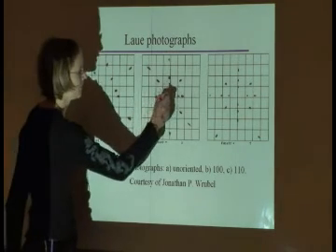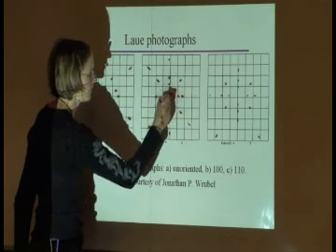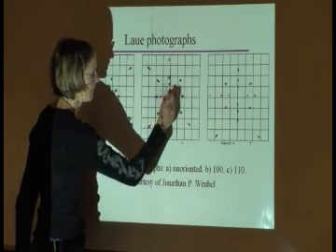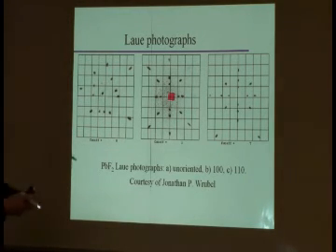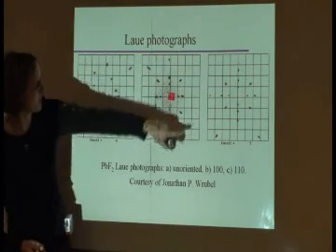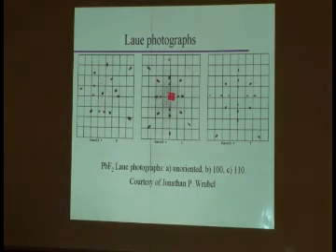Fourfold. Does everybody see that one? And as I said, this is real life data, so some people might say, well, there's no spot here, but there are spots here. If this was calculated, yeah, there should be an equal spot over there, but it's not calculated. So it might just be that the detector was shaded a little bit or something like that, okay?